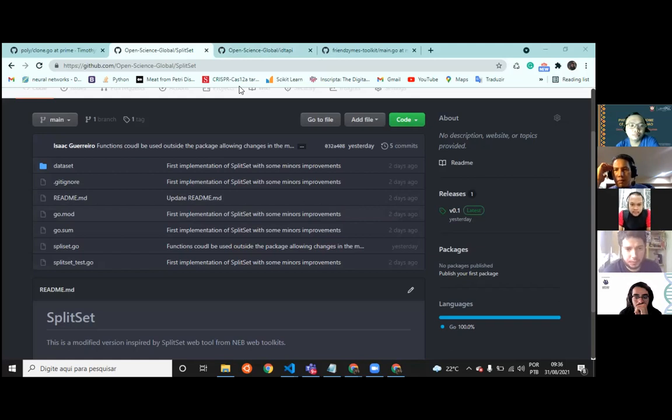One thing that I think would be useful is that programming this type of software is interesting for synthetic biology and any biology related problem, because design is a problem. If you take a lot of time to design, we're actually delaying all the other steps. So design is a threshold for how fast you could create something. Software is good for resolving this because if you don't have a specific heuristic, you could try everything, basically. Imagine that we don't know exactly what the perfect primer for your sequence is. A program is very good because you could try all the possible primers in some specific range and see what will be the best.